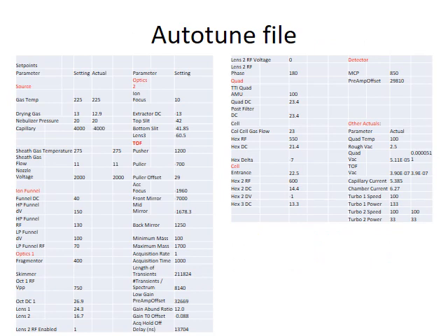In this slide, I am showing you a typical tune file. The red fonts are the ion travel path in this Agilent 6550 QTOF, starting from your ion source, ion funnel, to quadrupole, until detector. All the settings are shown in this file, and this file should be kept intact in some folder which you can retrieve easily.